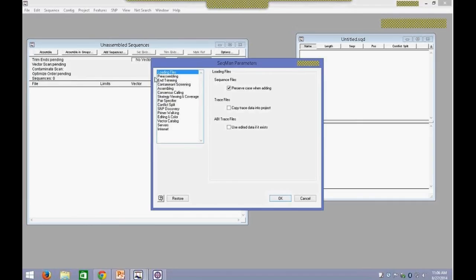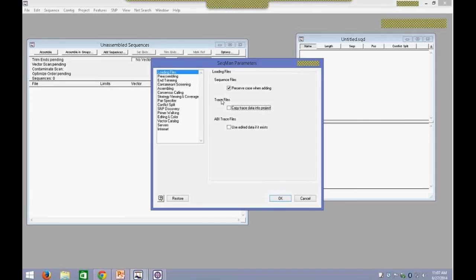This is where you can specify whether to save your trace data with your project. If you want to share your files with colleagues, I would recommend copying trace data into your project — this will keep all your chromatograms intact. If you do not have this checked, then your chromatograms will not be saved in your project. You will still be able to view your chromatograms on the computer you've saved your project on; however, if you shared that file with your colleagues, they will be lost. The reason it's turned off by default is simply because it's a smaller file size.